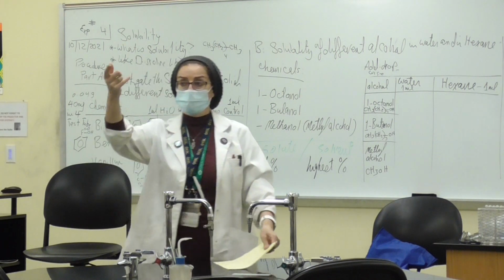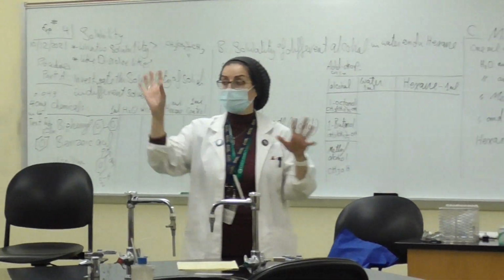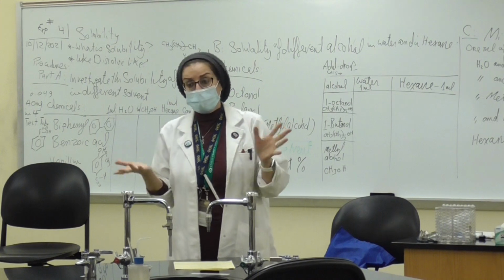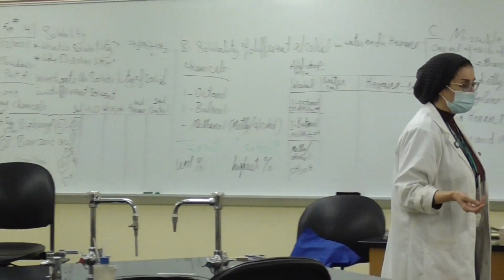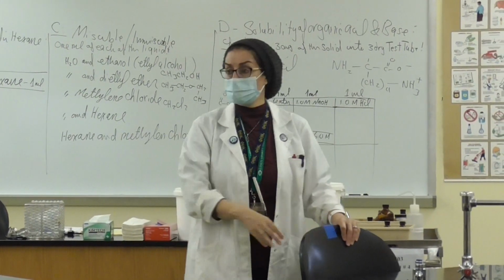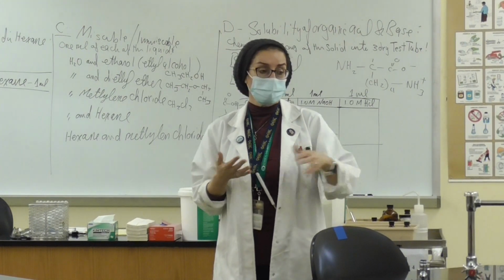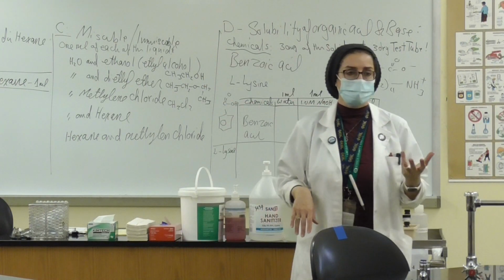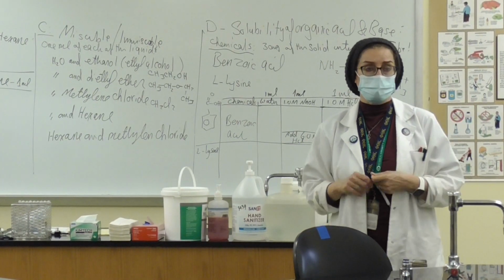So everybody, you need your test tube rack. You have the test tube here. All the chemicals are under the hood. You need your goggles. If you want to use gloves, the gloves are here. Although with HCl, usually I would not prefer the gloves, because those kind of latex gloves are not the proper gloves that we need for strong acids and strong base.